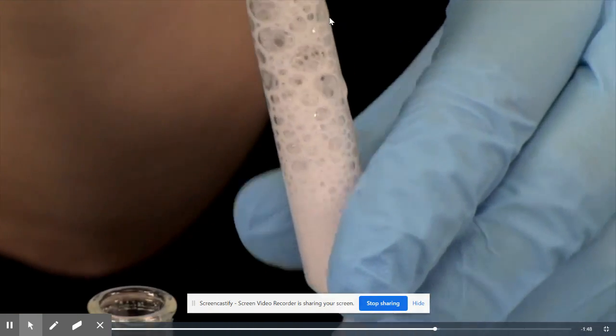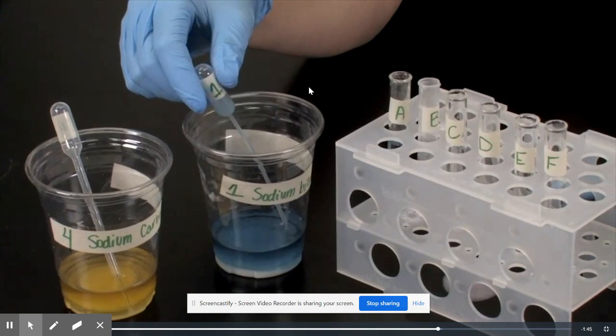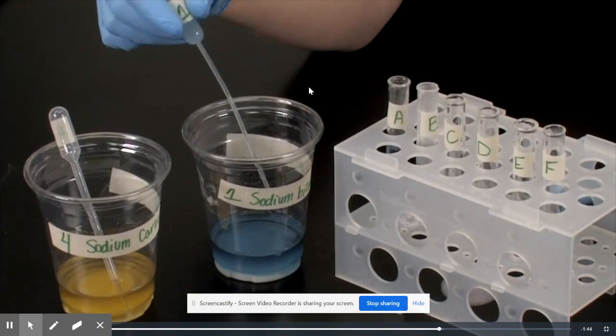All right, so for test tube B, sodium bicarbonate plus calcium chloride, it turned purple. Color change, yes, purple. Temperature change, no. Gas produced, no. Precipitate, yes. Evidence of a chemical change, yes. This one is kind of interesting because you would think that there was a gas produced because there were bubbles. So let's just go ahead and say gas was produced on that one.